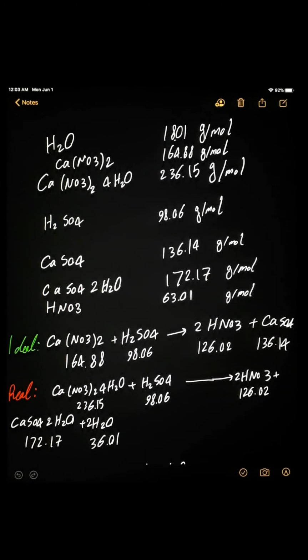Hello again. In this video we are going to look into preparation of nitric acid. Now one might think that you can just go and purchase your nitric acid. However, in Canada, nitric acid is somewhat of a controlled substance.